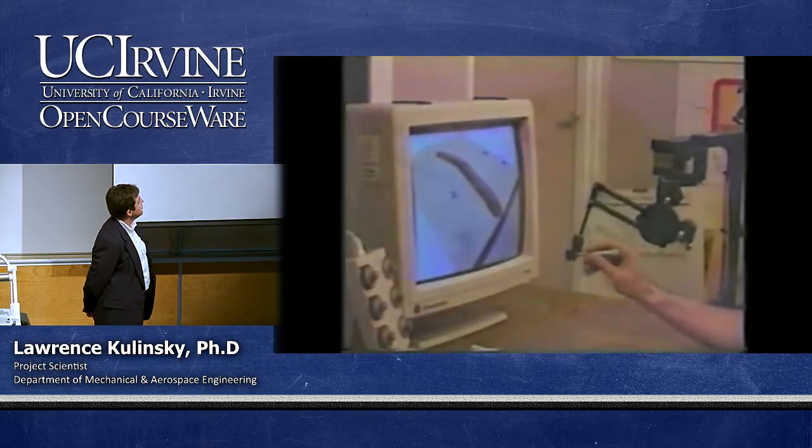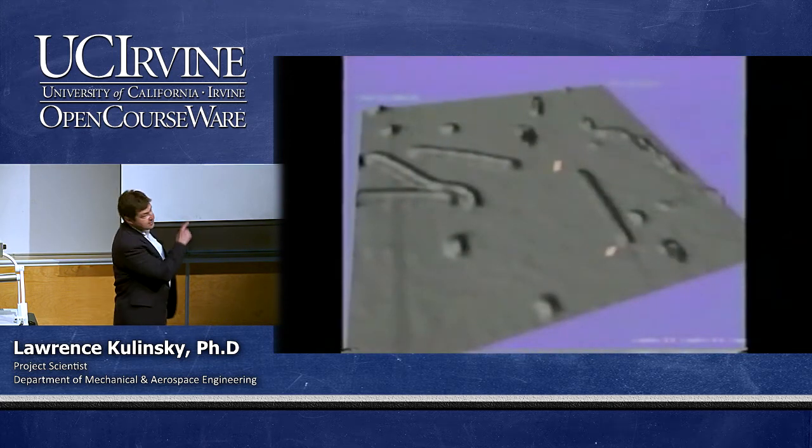You take the individual blocks, put them where you want them to go. And then we had to demonstrate that we could do this over and over again with atomic level precision. So putting the atoms into a regular pattern was one way to do that. That worked out very well. Understanding the properties, movement, and interaction of various materials at the nanoscale. That's pretty cool.